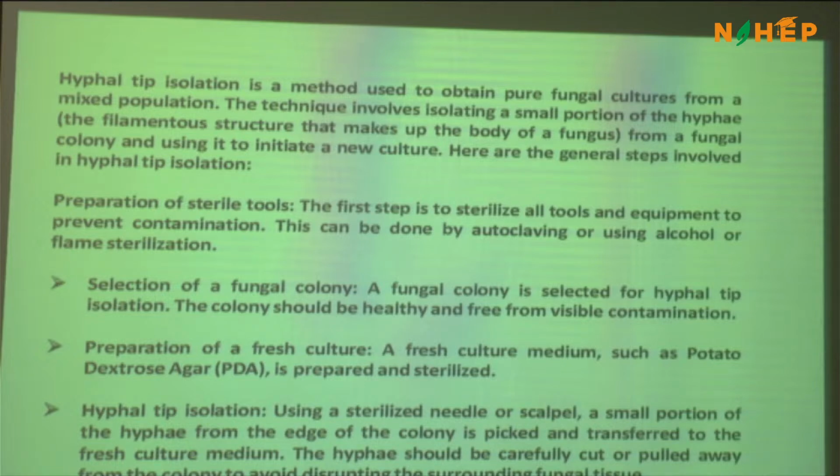So sterilization assumes its own importance here. Ensure that all your experimental tools are properly sterilized. Your flow cabinets are properly maintained. There is no carryover contamination from the previous work. Filters are clean, and these are all some of the housekeeping things you are supposed to do before addressing this fungal isolation, right? And the hyphal tip method, you follow that.